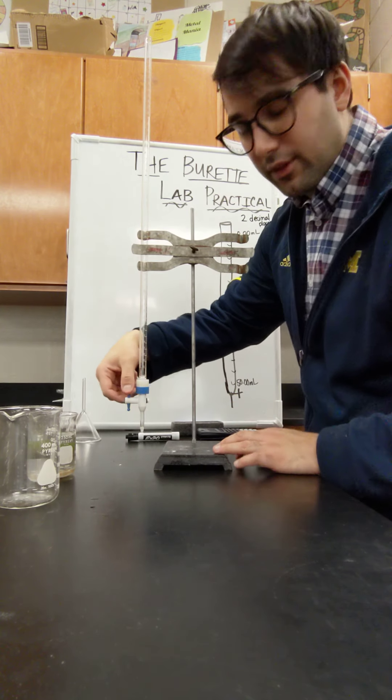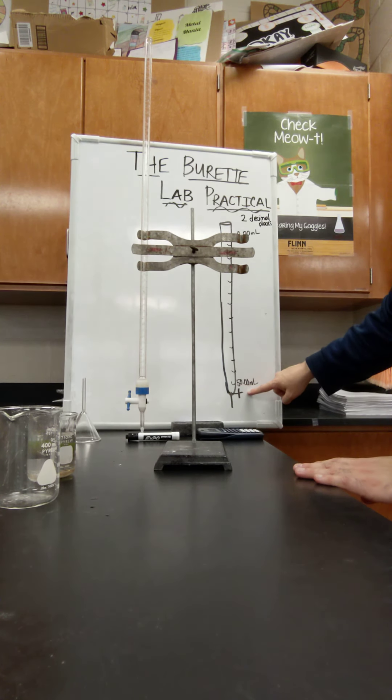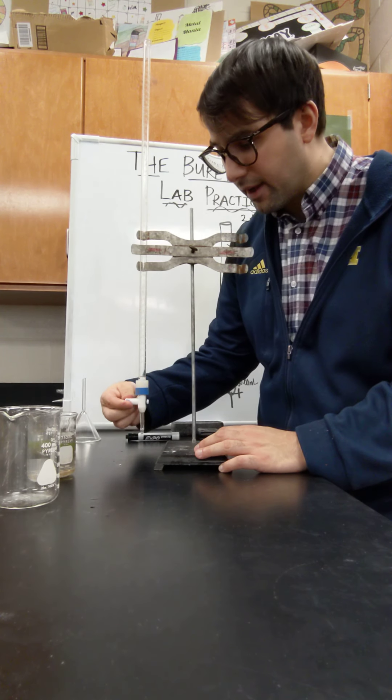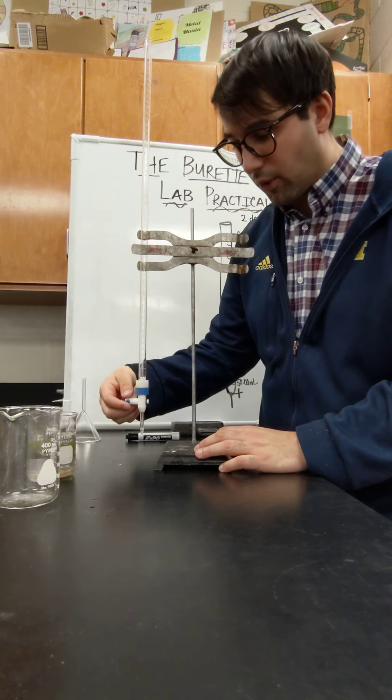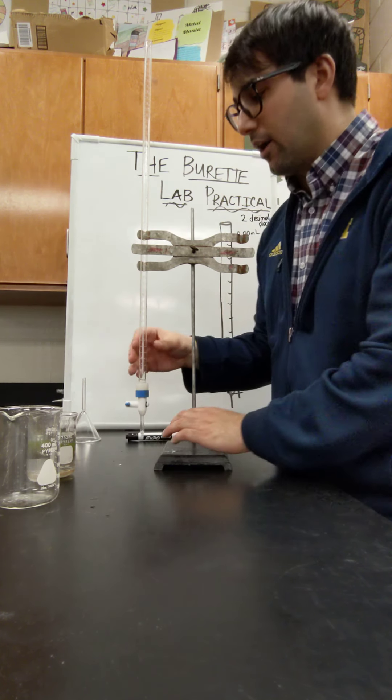On the side here is a handle thing called the stopcock. I have it drawn on my diagram. If the stopcock is facing towards you, it's closed. If it's up and down, it's open. I'm going to close it right now.